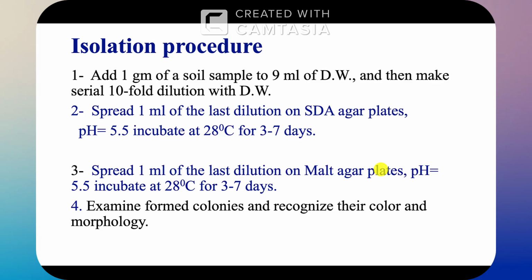If it is 6, the fifth tube and sixth tube are the last ones; if it is 8, it is better to do 8 dilutions. So the seventh and eighth tubes.